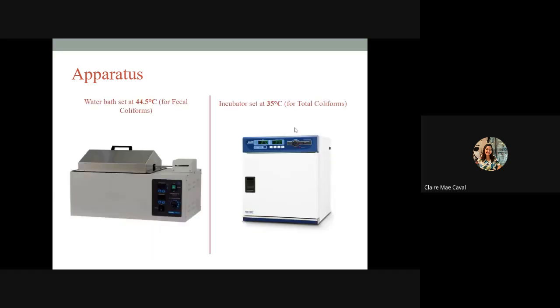Miss, is it possible to use a dry incubator for fecal coliforms? Yes, it is possible to apply dry incubation for your fecal coliforms as long as it is set at 44.5 degrees Celsius.